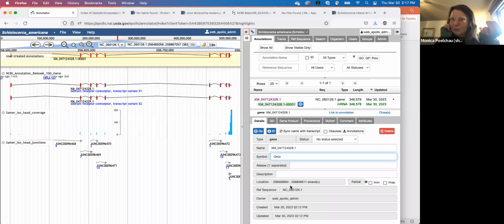So there's one thing. The second thing is, this is something I haven't tried yet either, but I've cleared this with Terrence Murphy as well, is if you just want to change the symbol or the name, I just put it into a tab delimited file and give the link to that tab delimited file to RefSeq, and they pull it in. So it's a much easier process to change the naming, the symbol, gene, and product name, where product is the mRNA related name.